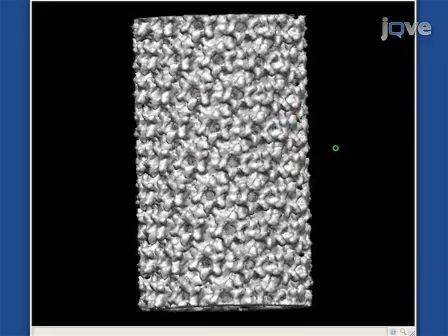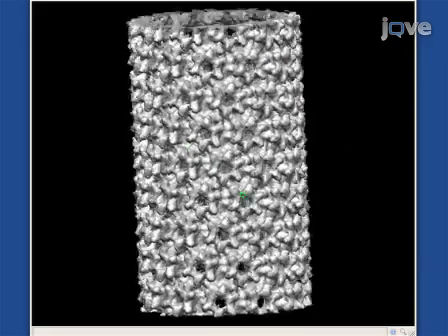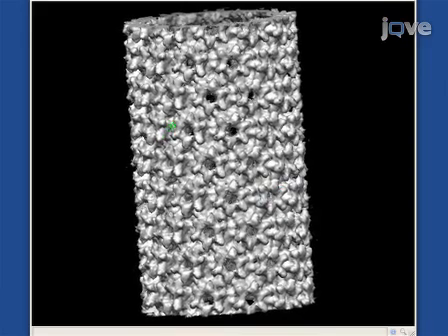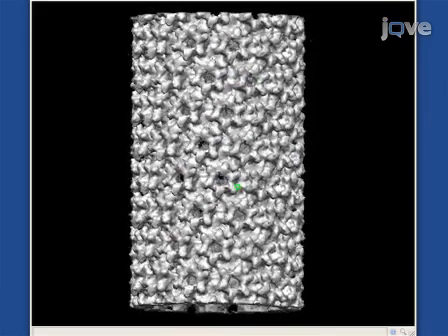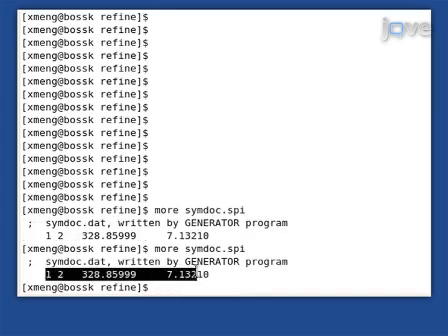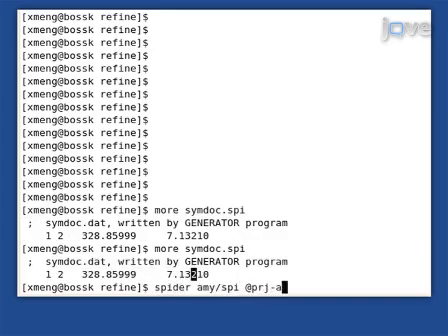Finally, perform 3D reconstruction with iterative refinement using the 3D density map generated by IHRSR as an initial reference for additional refinement. During the refinement, the helical symmetry is fixed at the rotation between subunits and axial rise, which are determined from the IHRSR procedure.